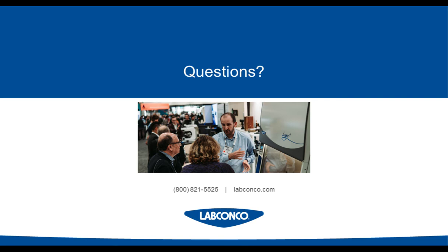If you have a particularly bulky material or perhaps a microscope, you can certainly go back and have that certifier test that BSC with that equipment in there, which will help you get a better understanding of what's happening when that equipment is loaded. I'm familiar with the concept of certifiers asking for everything to be pulled out. If you have a large piece, a box, something large in there, there's certainly nothing wrong with having them evaluate that piece of equipment inside the BSC to get a better understanding of what the biosafety cabinet is doing.